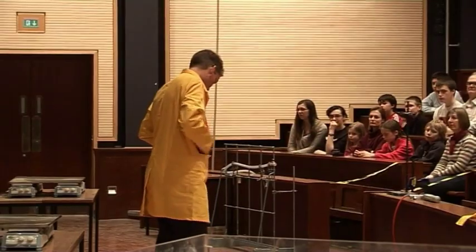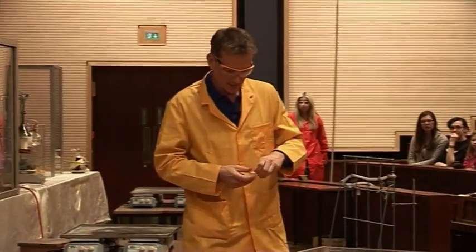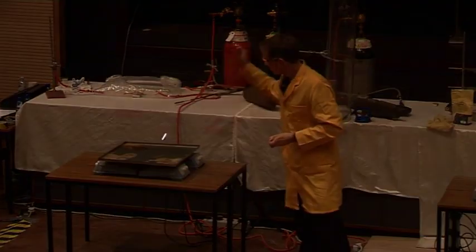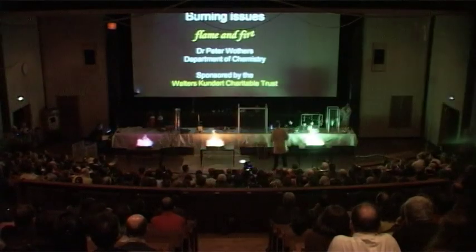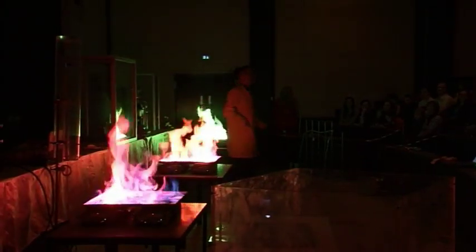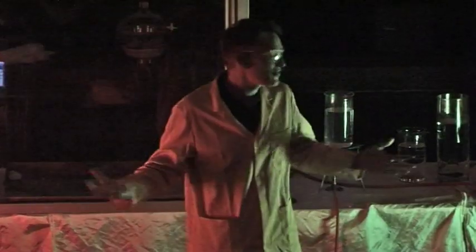Now then, goggles on. Plenty of things burn, and in these trays here I have some alcohol. Let's see if we can set fire to that. Can we have the lights down, please? The trays contain an alcohol, and this is burning with the evolution of heat and light.